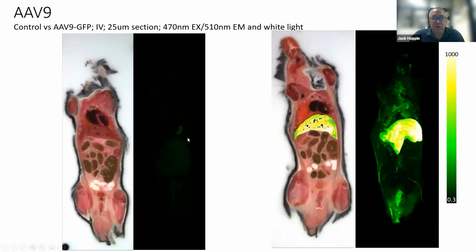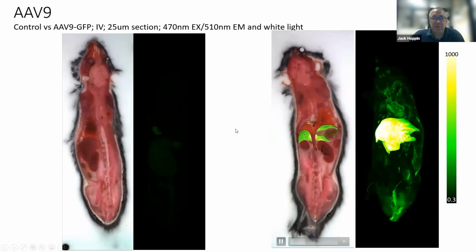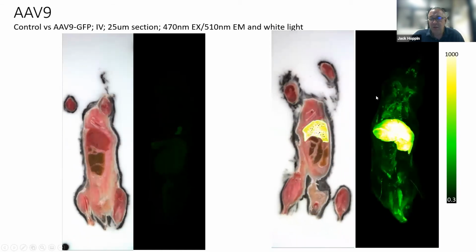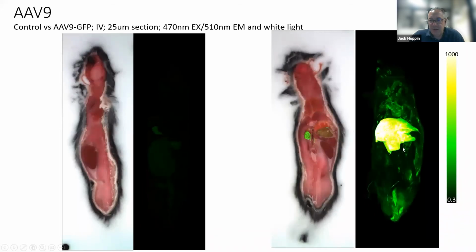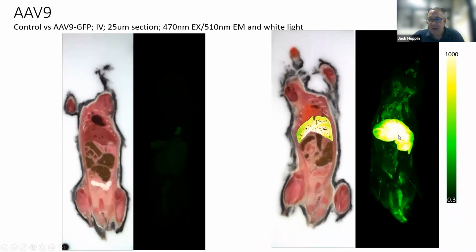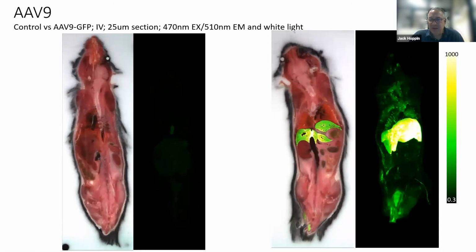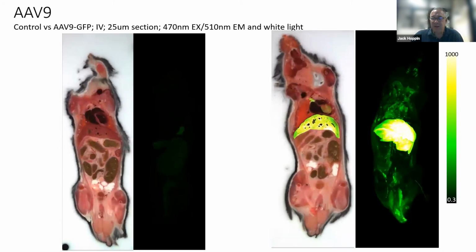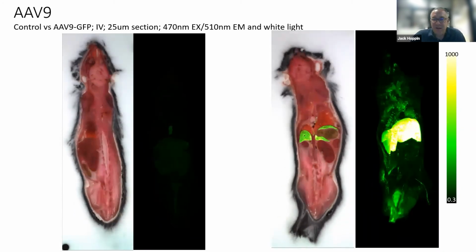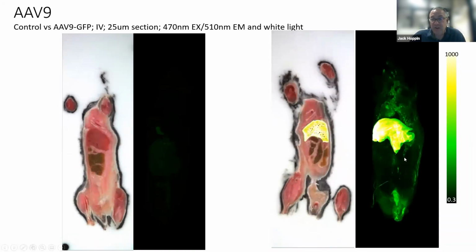You can see porphyrin prevalence in the gut, much lighter. Following systemic administration of these AAV9s, a few weeks out, you're looking at transduction of these AAV9s and subsequent expression of GFP. I want to remind people, as I said, I'm a mathematician, so all of this biology typically amazes me, and if I misspeak in any way, I don't proclaim to be a geneticist or an expert in AAVs, that's for sure. But you can see an incredibly striking distribution now of where GFP is expressing.